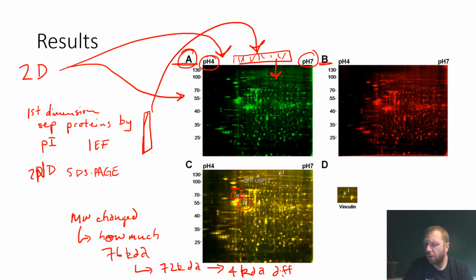That is 4,000 daltons, so that's almost, I'm going to use a tilde, ~40 amino acids. What happened to those 40 amino acids? Why are they gone? Well, maybe there's a protease in one specimen that's very active, and it's going to cleave these chunks off. It's going to cut those 40 amino acids off, and they're gone. We don't know. That's the important part about this technique.